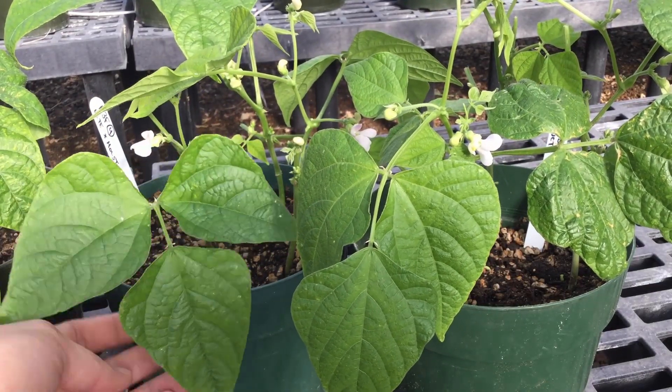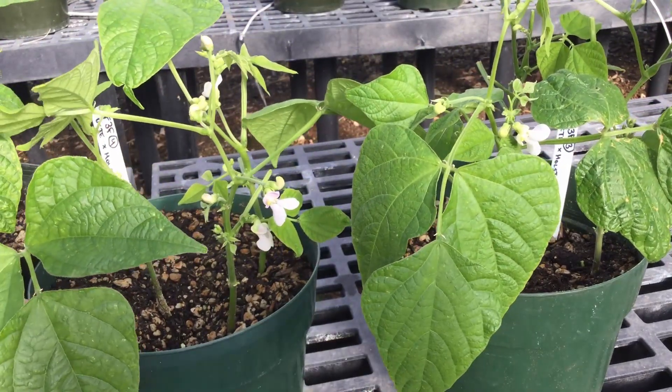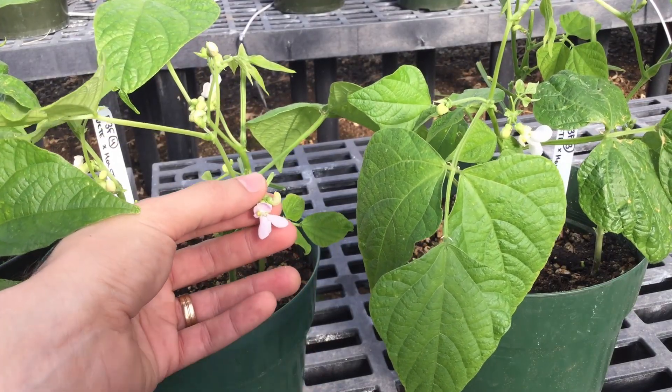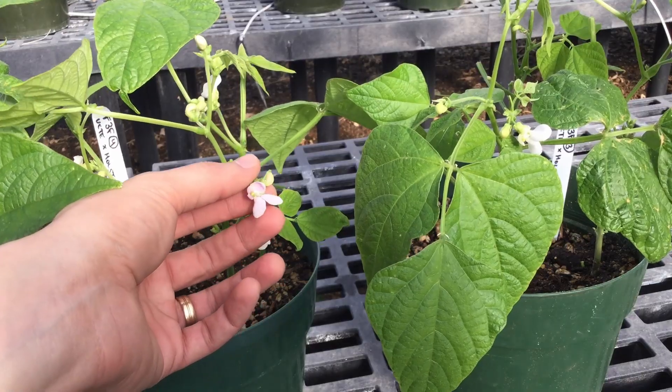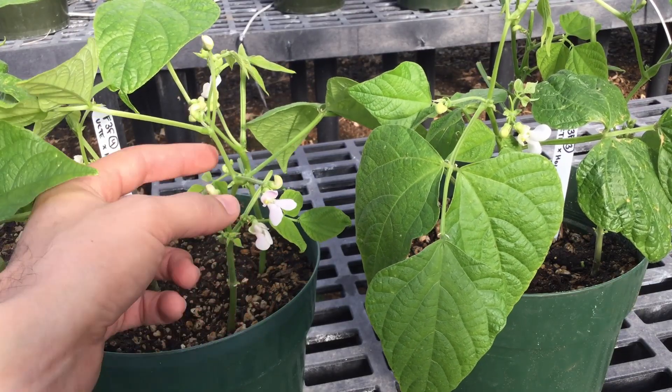To start off, we're going to need two plants that we want to use as parents. The plant we're going to use as a father should have open flowers that look like this — nice and crisp and not at all yellow. If they're at all yellow or wilty, then that means they're too old to use, so we don't want that.